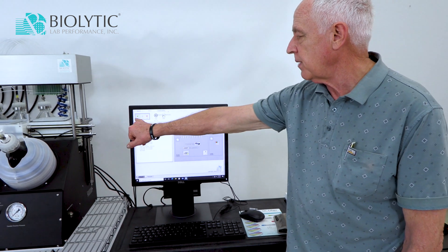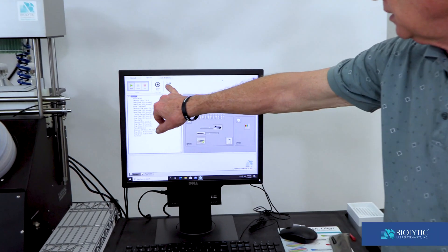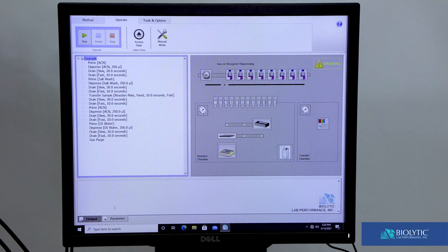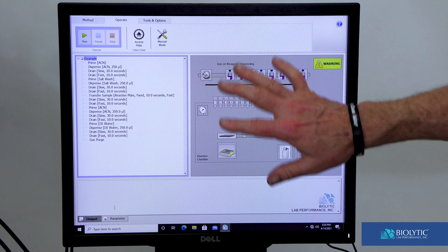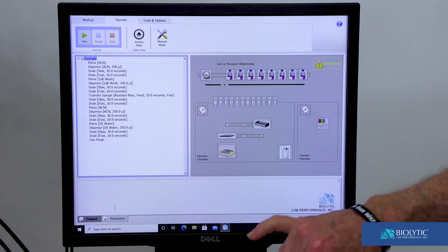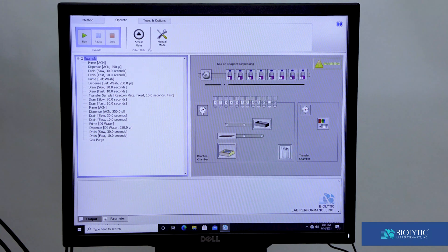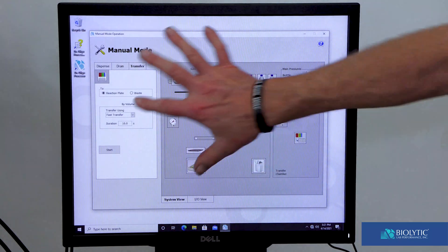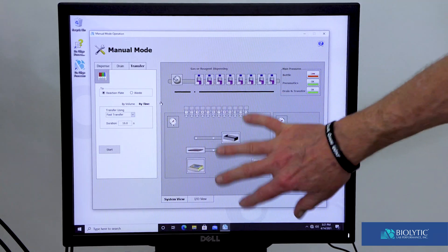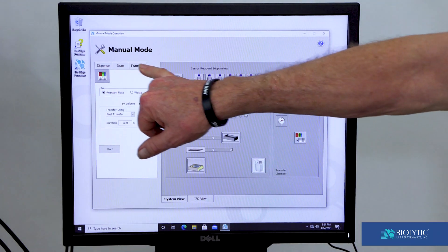The Operate section has automatic operation, which is this button, and it has a manual mode over here. When running in automatic mode, the display changes constantly to indicate what it's doing, and the current step is highlighted. If we're in manual mode, clicking on Manual gives us another screen that looks very similar, and we can still observe what's going on with the pictorial display.